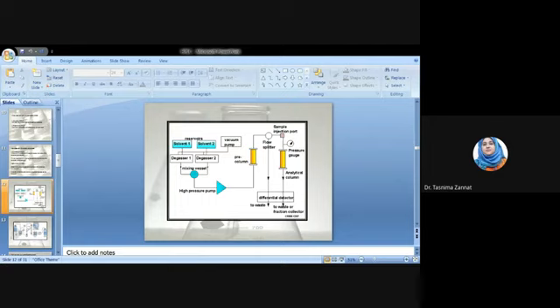At the exit point of the analytical column, there is a device which is called the detector. The detector can detect the components, and finally it sends the signal to the output device, meaning the computer. This total system is connected to a computer, which is called the output device, and from the computer you can get the data. This is the total mechanism of the HPLC.